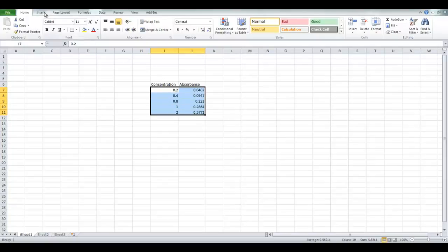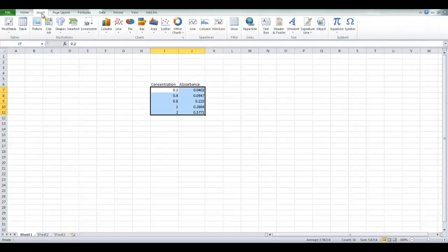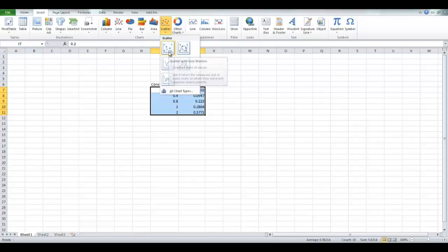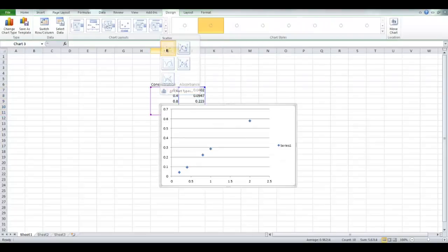Go up to Insert and choose Scatter. Choose the one at the top left corner. That will create, as you can see, a scatterplot graph.